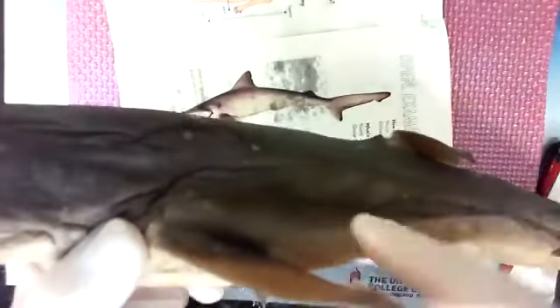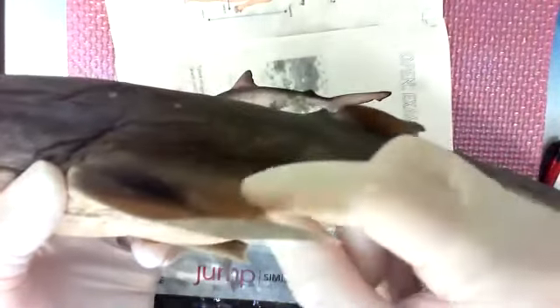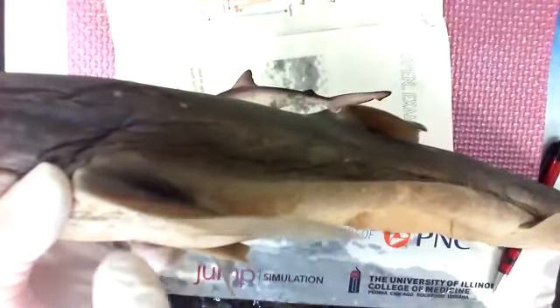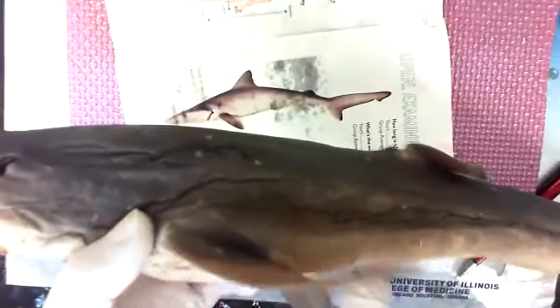Sharks can't do that. Sharks don't have a lot of muscle in here. Their muscle is primarily to tilt up and down like this, because their fins act more like wings on an airplane. And wings on an airplane don't flop up and down. They just bend the back part so that when they're moving forward, they can steer, right? Push up, shoom, pull down. That's how these are. So they're more like a wing than a flipper.